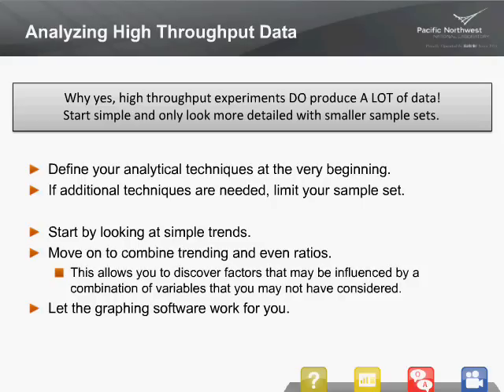That's why we look at mass recoveries. We look at carbon distributions between gas, liquid, and solid. These are things that we can use to go, okay, that catalyst isn't very good. We're not going to look at it much in detail anymore. And then we can do more longer-term analysis techniques such as HPLC, elemental analysis, things like that. So that's the number one step in keeping it simple and then becoming more detailed.